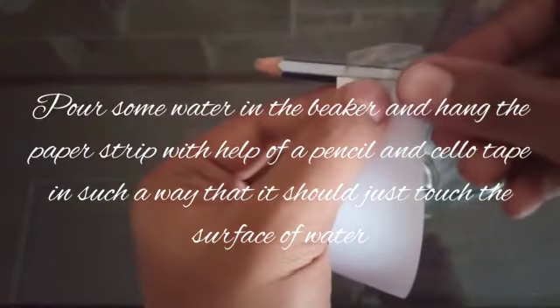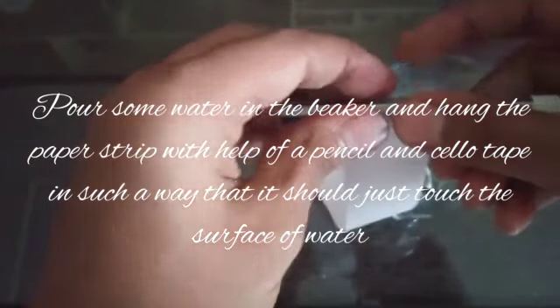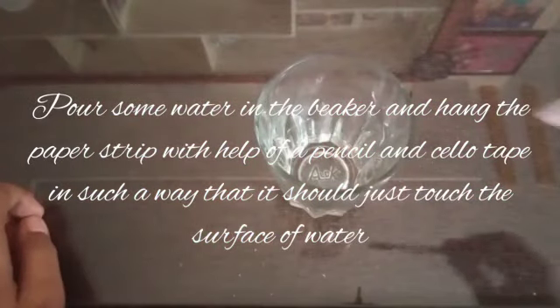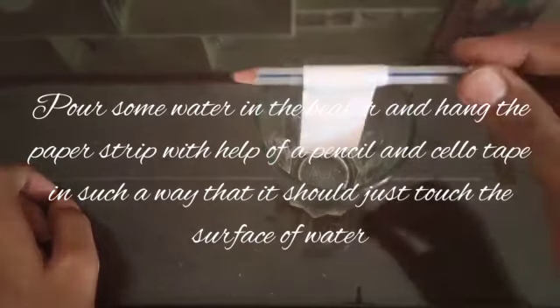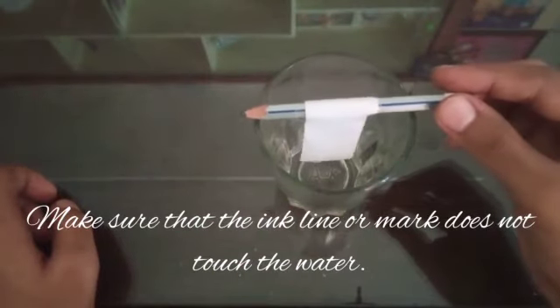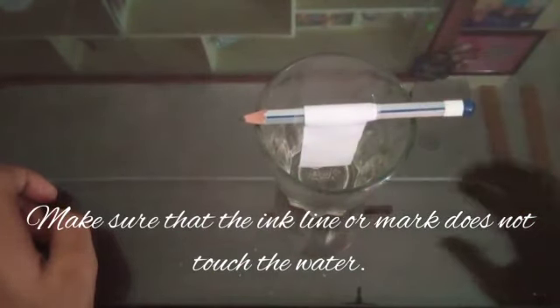Pour some water in the beaker and hang the paper strip with help of a pencil and cello tape in such a way that it should just touch the surface of water. Make sure that the ink line or mark does not touch the water.